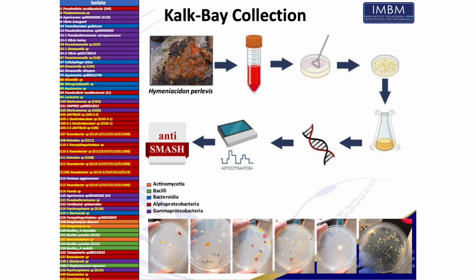All right, but the first thing we did, as we always do, is to culture, because there's every possibility that you've got the right set of conditions for culturing these guys. And Rob also told you earlier that culturing is where it's at, because if you have the bug in hand, then of course, there's a lot you can do with it. So this slide just shows you the kind of workflow. We've got the sponge, we squeeze out that orange juice, plate it on media, incubate, and then we are obviously interested in what they have on their genomes. So we then isolate the DNA, do the sequencing, and then, like I said, we've got fantastic bioinformatic tools with which to hunt for these suites of genes.